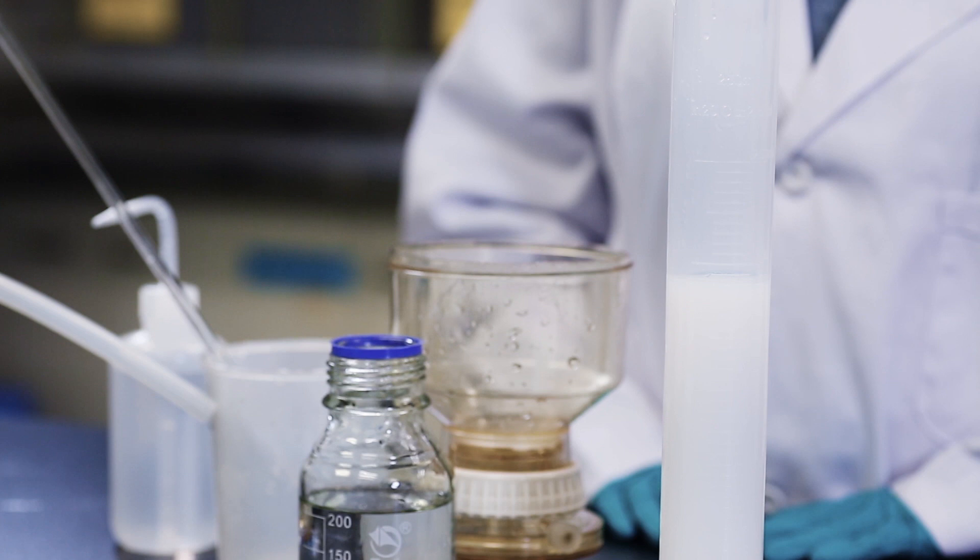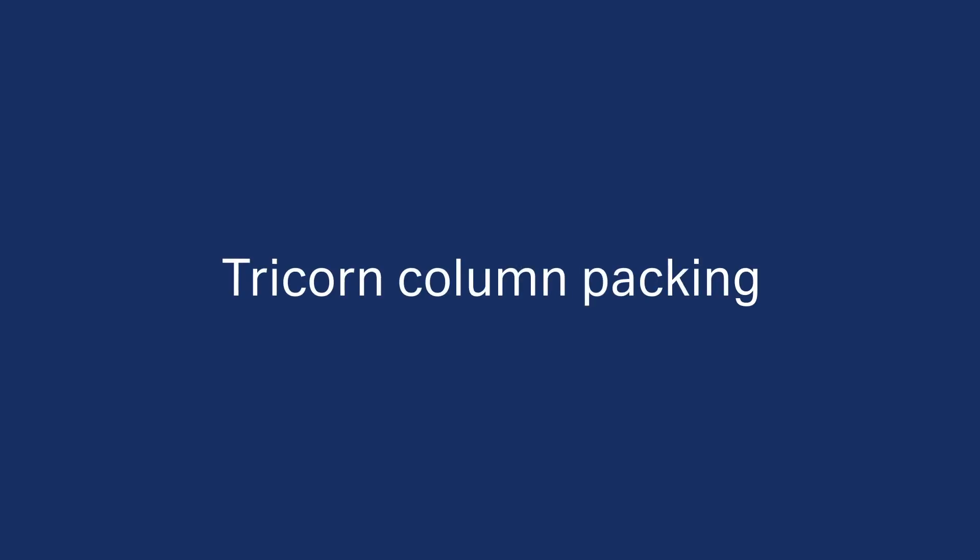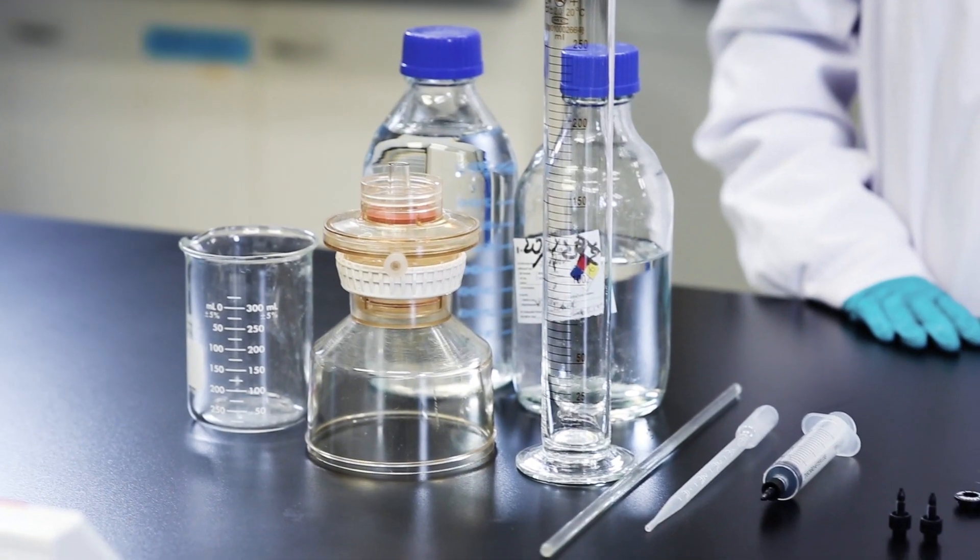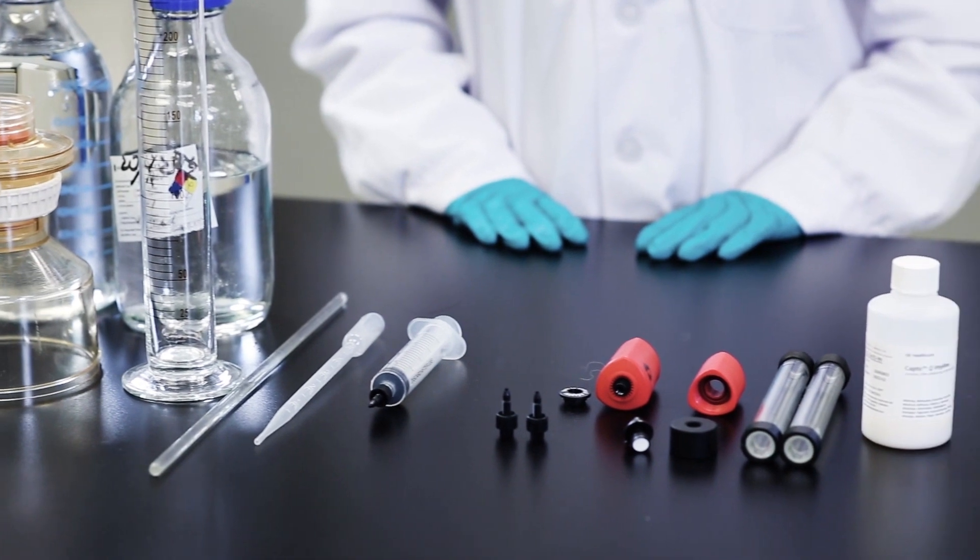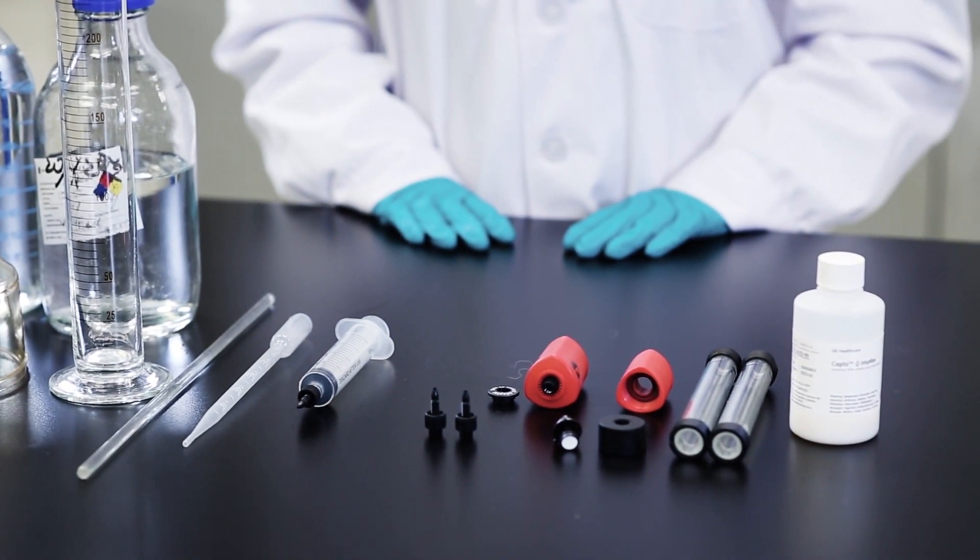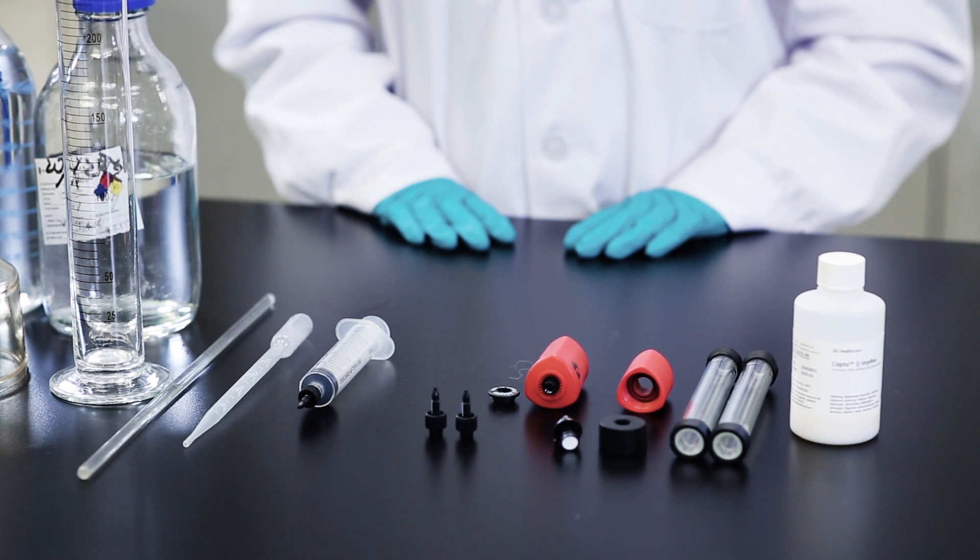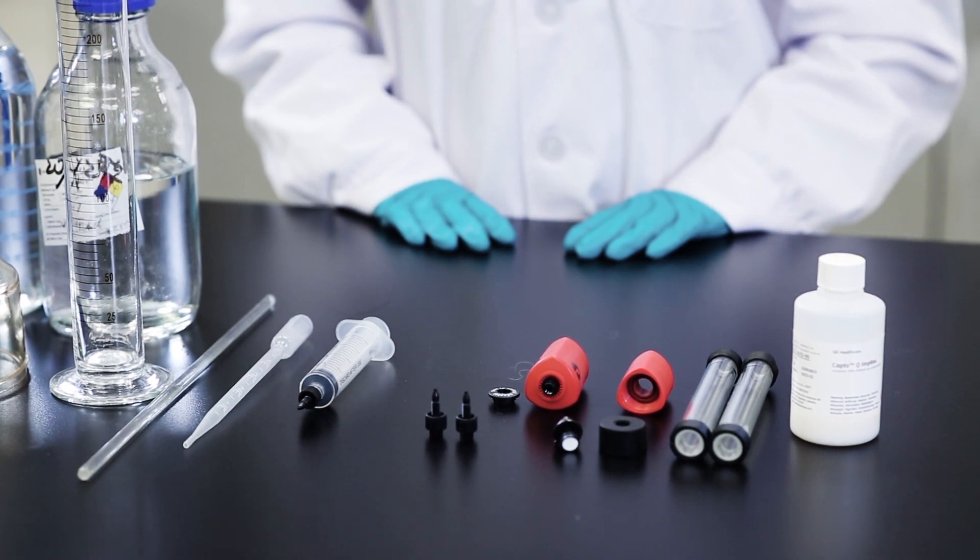Now that you have prepared the resin, the next step is to prepare the column. In this video, we will guide you how to pack a Tricorn column with the anion exchanger Capto-Q Impress. The dimension of the column is 10 mm inner diameter and 10 cm height. We will pack the column with approximately 7 milliliters of resin.